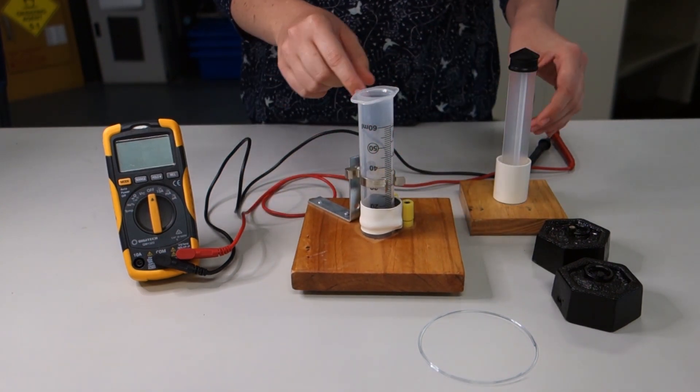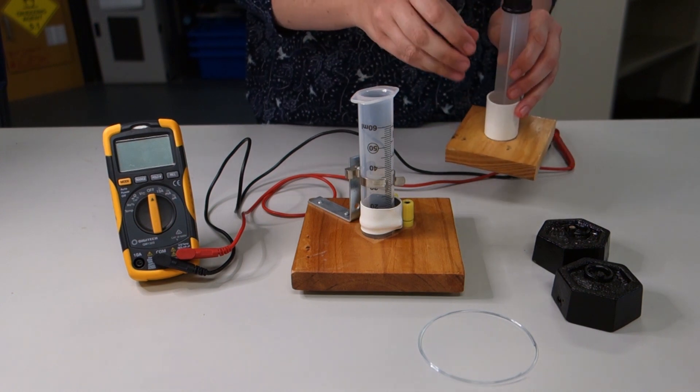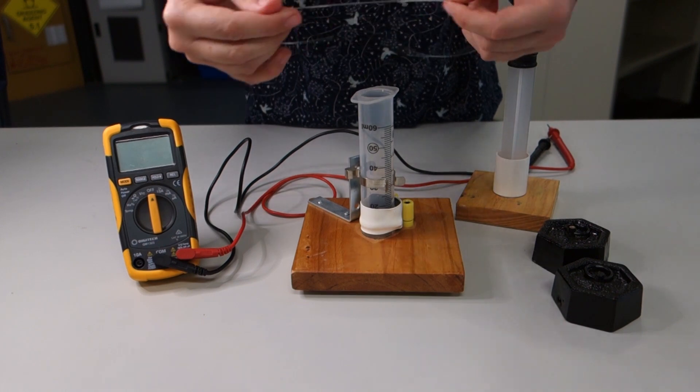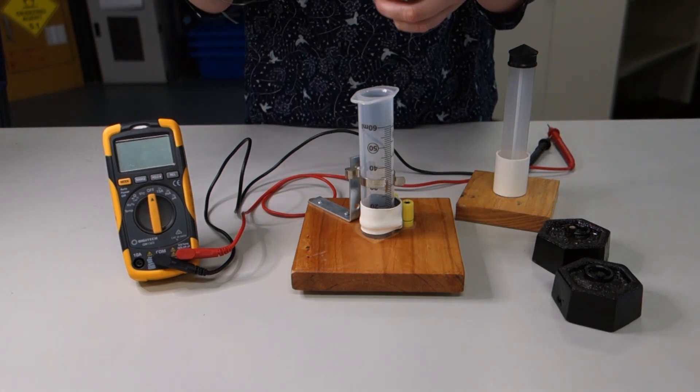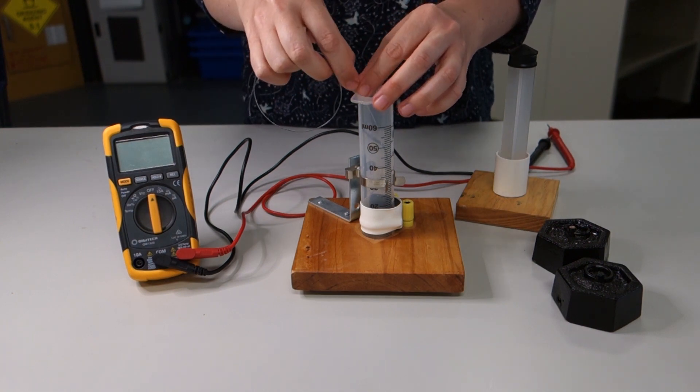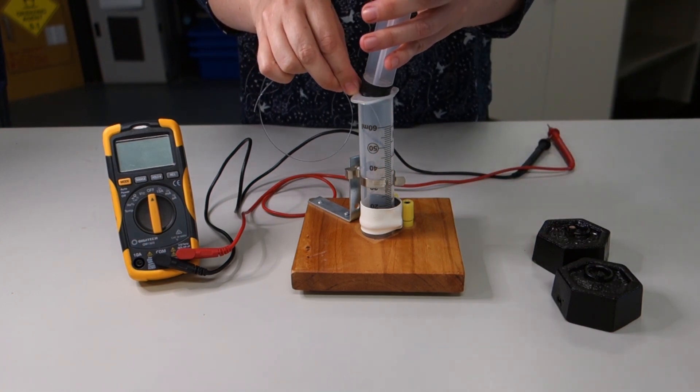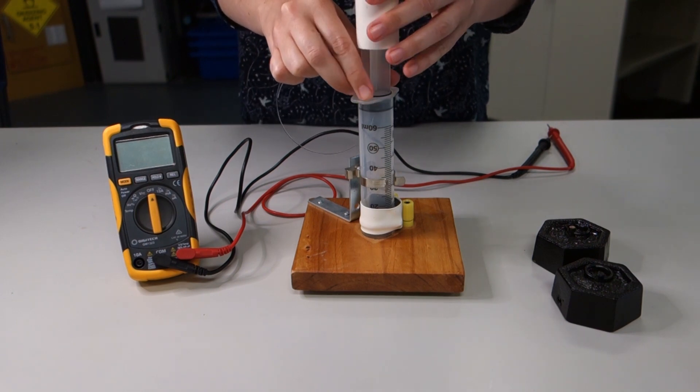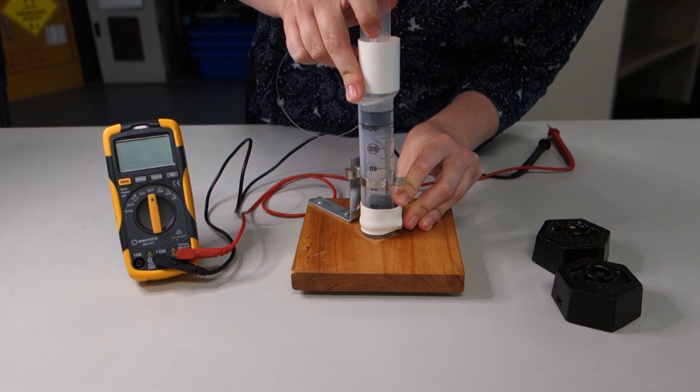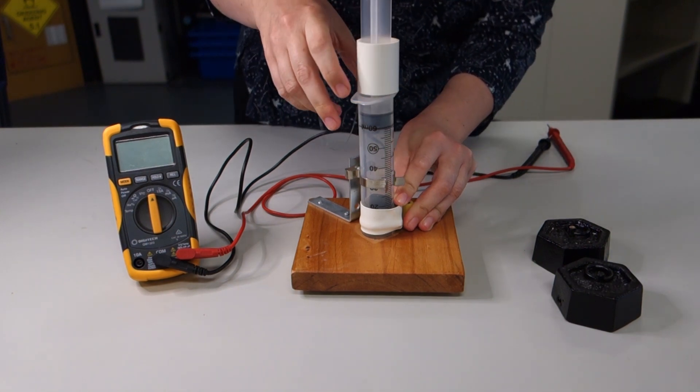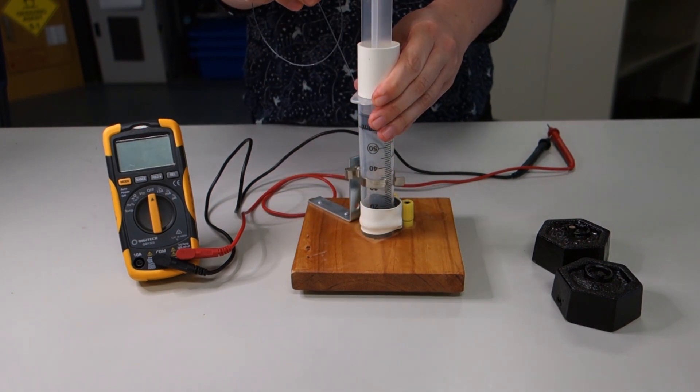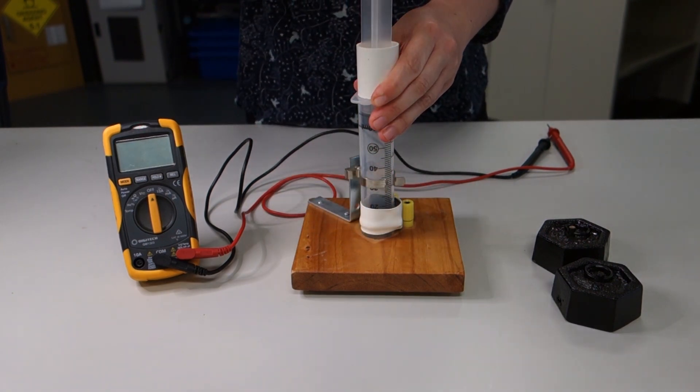To position the plunger in the syringe, use the fishing line provided to break the seal between the plunger and the body of the syringe. Position the plunger. In this case, I am going to position it at 60 mL and then remove the fishing line.